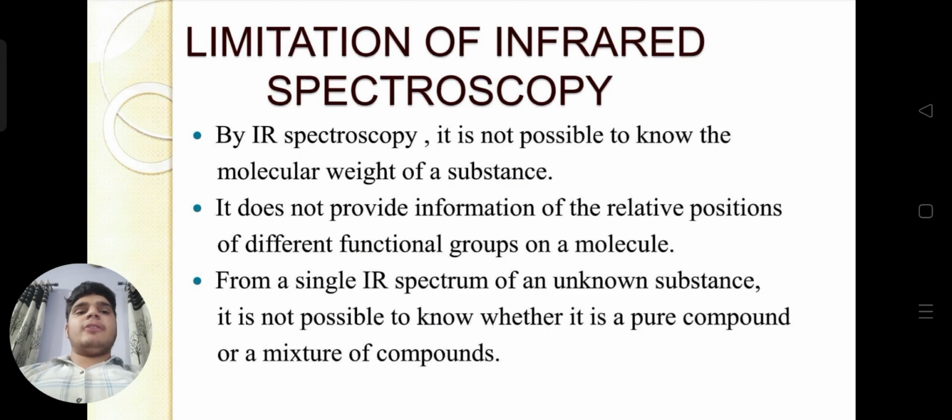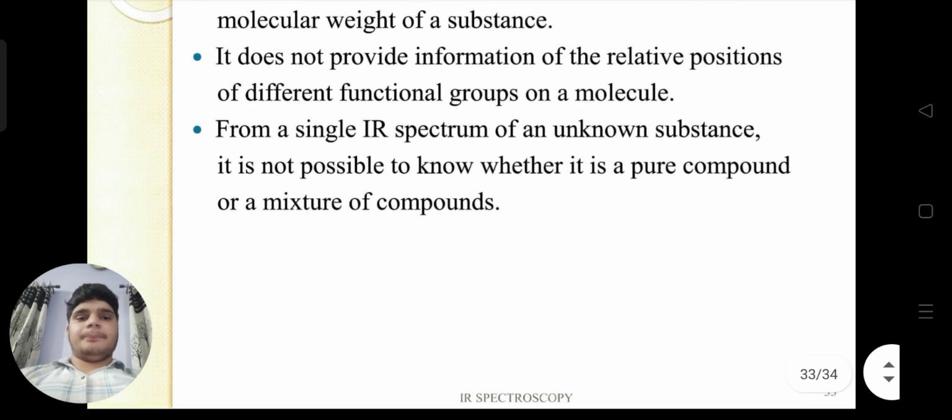It does not provide information on the relative positions of the different functional groups on a molecule. Also, from a single IR spectrum of an unknown source, it is not possible to know whether it is a pure compound or a mixture of compounds. We can only show the presence, not the purity.